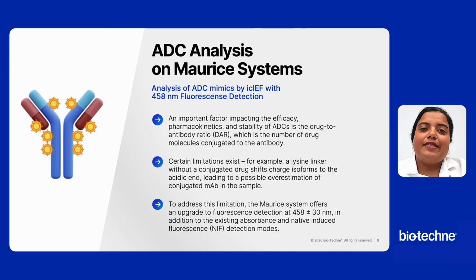Now let's look into ADC analysis on the Maurice platform. As you all know now, an important factor concerning the efficacy, pharmacokinetics, and stability of ADC is the drug-to-antibody ratio, just DAR, which is defined as the number of drug molecules conjugated to the antibody. Attaching too few drugs to the antibody can lead to low efficacy, and attaching too many drugs can lead to high clearance rates, instability, and systemic toxicity. Therefore, the DAR must be carefully monitored during the synthesis of all ADCs, and measures should be taken to ensure the DAR homogeneity.